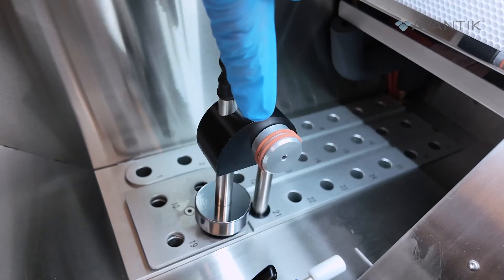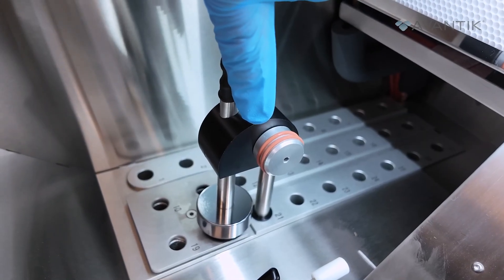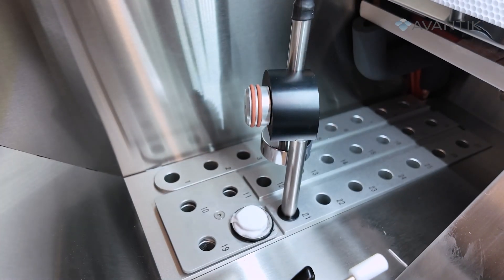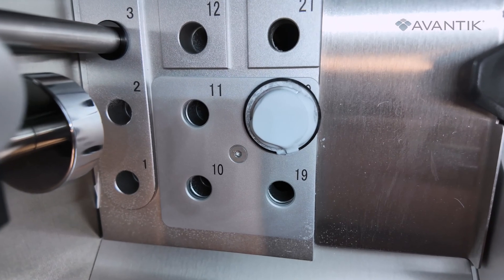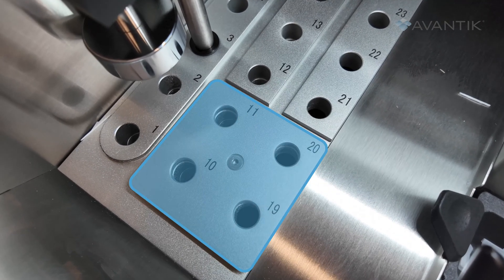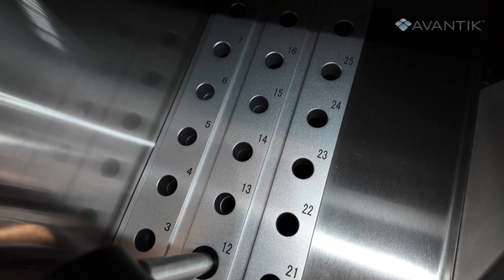The QS12's heat extractor promotes faster freezing from the top to bottom simultaneously, reducing the formation of freezing artifacts. Also, the Peltier provides fast freezing for 4 stations and up to 27 stations total.